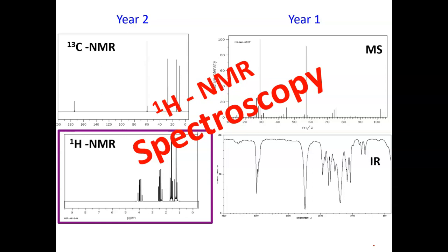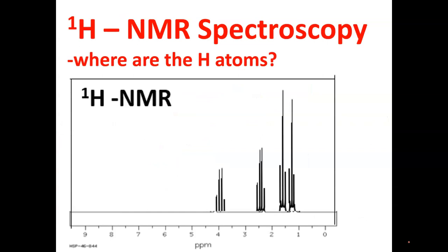First of all, if we take a look at a particular spectrum, then we will see, for instance, this one. As you can see, this is an NMR proton spectrum of a compound you're going to meet again, and it's a little more complicated. We still have the signals, we still have the chemical shift scale, but for proton spectra the chemical shift scale is a much reduced range, from 0 to about 12 parts per million compared to the TMS reference, of course, which is always marked at 0, or we don't always show it.